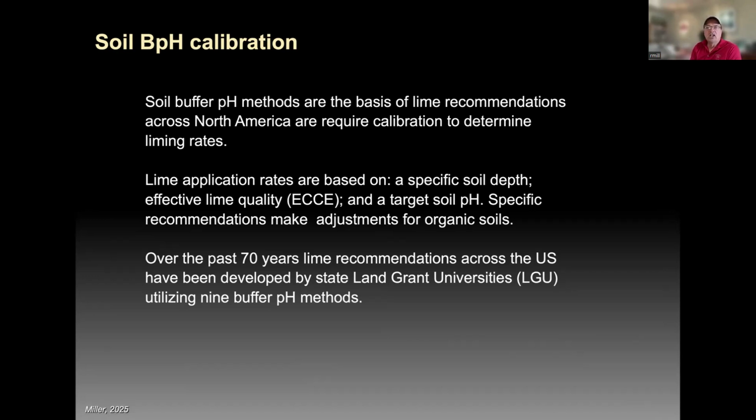All this is based on land-grant universities, and most of this data has been done over the last 70 years. In fact, rarely is any of our lime calibration data newer than 30 years. I believe Iowa State and Oregon State are the only universities who have developed any new calibration data that's less than 30 years old. And believe me, it gets kind of complicated because we have 9 lime buffer pH methods, and then, who did the work and how many soils did they do.